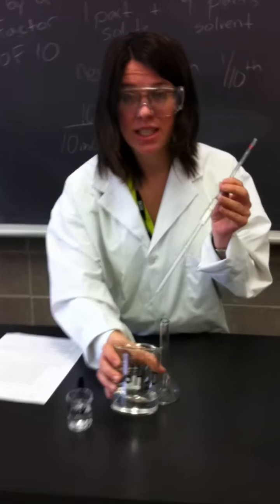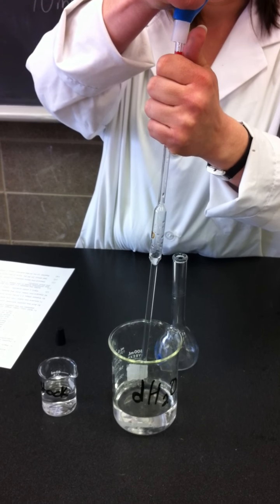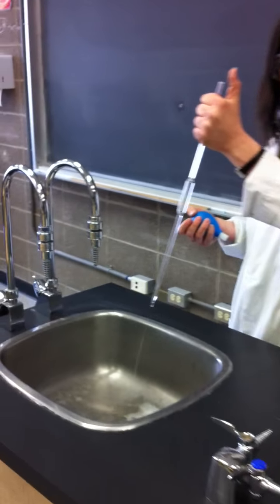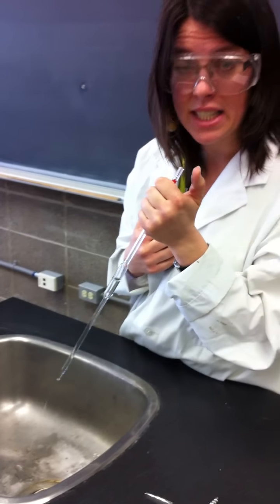So I'm going to clean it with distilled water. I'm just going to bring up some distilled water and rinse my pipette 3 times. So bring up the distilled water, and you can just discard it into the sink. Just discard your distilled water into the sink. You're going to do that 3 times to make sure your pipette is clean.